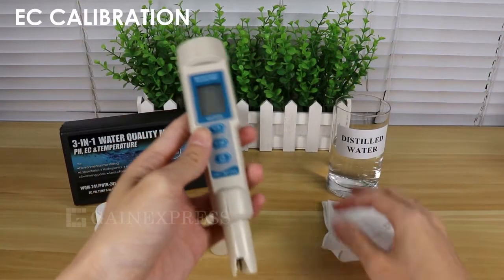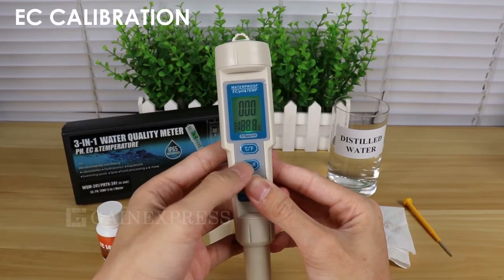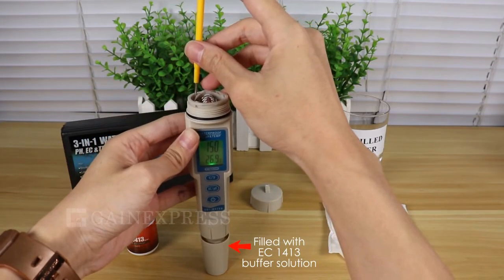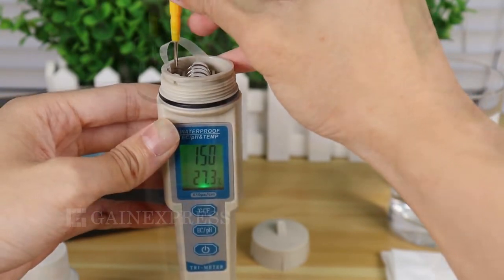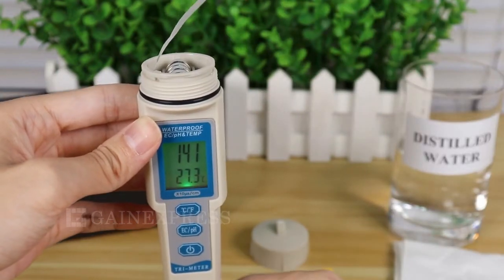Now, for EC calibration, select the EC unit by pressing the EC/pH button. Immerse the meter into the 1413 solution. Slowly turn the EC calibration trimmer until the display shows 1413. Again, if the display value is within the error range, it is acceptable.